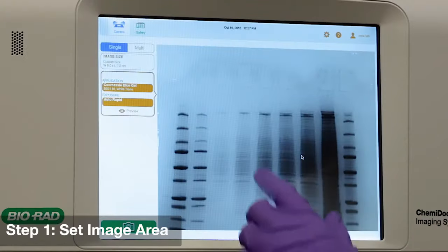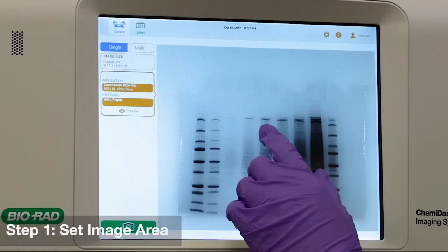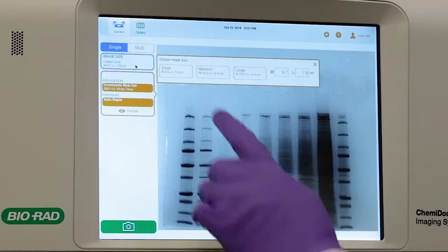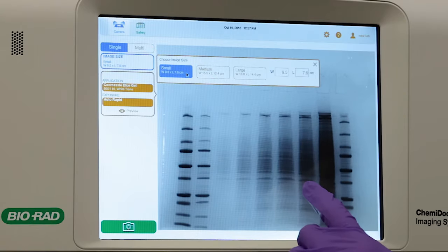Zoom into the desired imaging area. If you prefer, simply select small, medium, or large under image size.